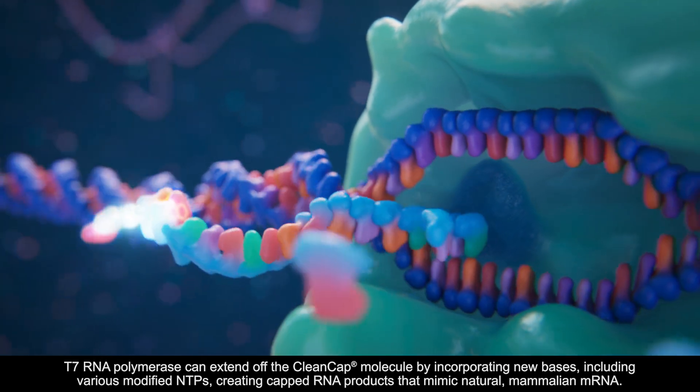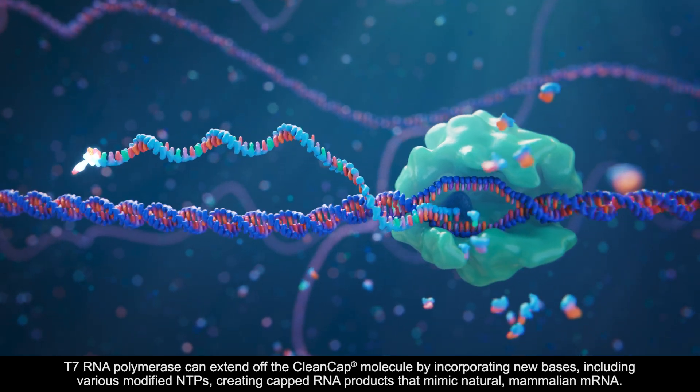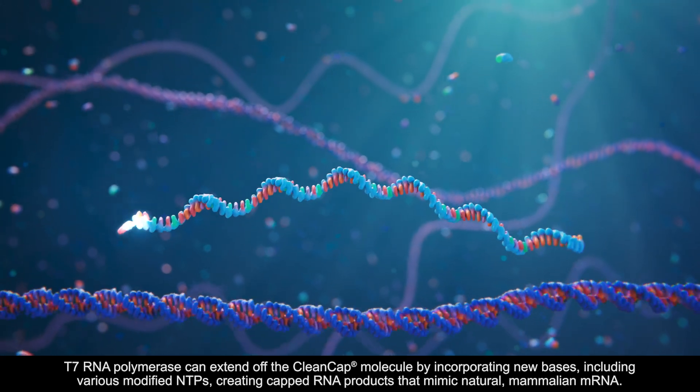Base pairing occurs between the AG bases of the CleanCap molecule and the DNA template. T7 RNA polymerase can extend off the CleanCap molecule by incorporating new bases, including various modified NTPs, creating capped RNA products that mimic natural mammalian mRNA.